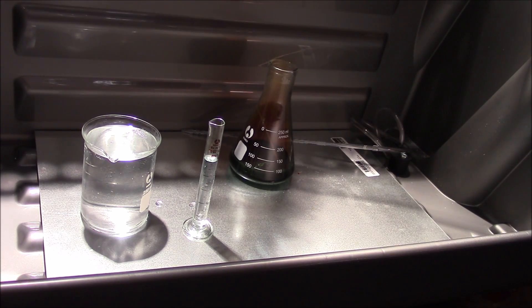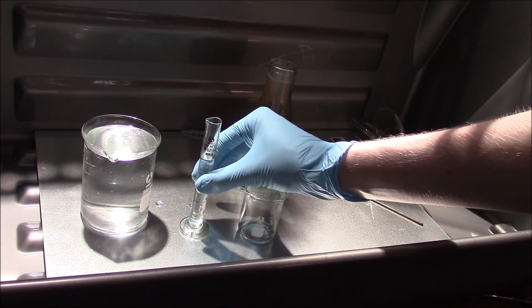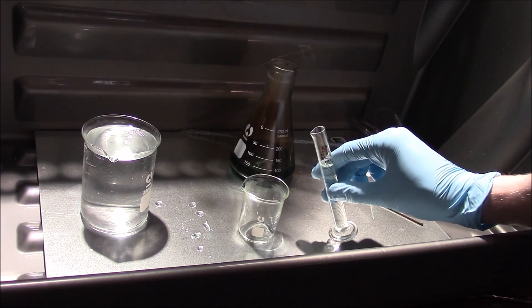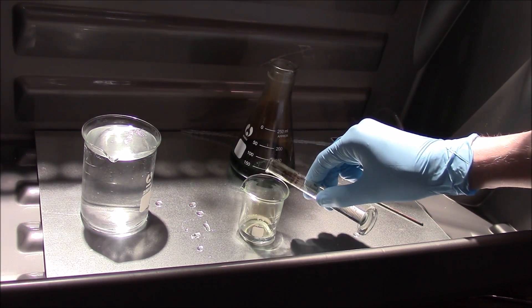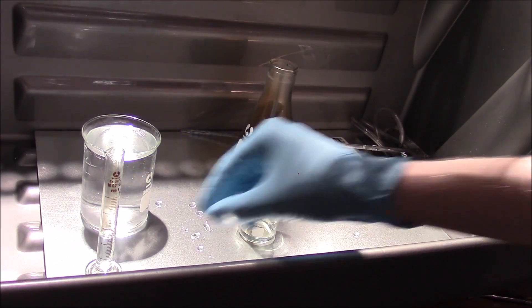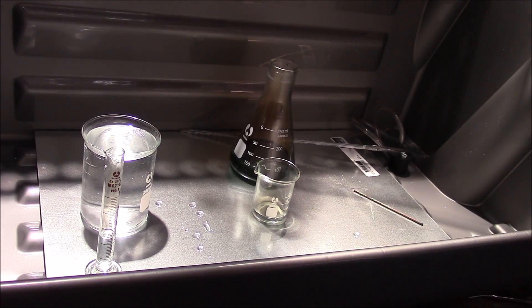Now we want to test out our nitric acid, so let me get a little cylinder and a small beaker. We lost a little bit of our acid — pour a little bit in there — and it has just a very slight tint to it. What we're going to do is cut a piece of that copper and drop it in, and it should produce the characteristic nitrogen dioxide reaction.